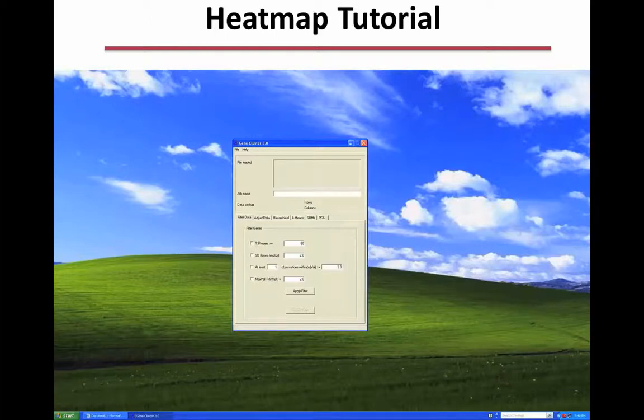which we can do just from the menu option here. So you select the data file that you just made, a tab delimited text file, and you can see it appears in the window here.